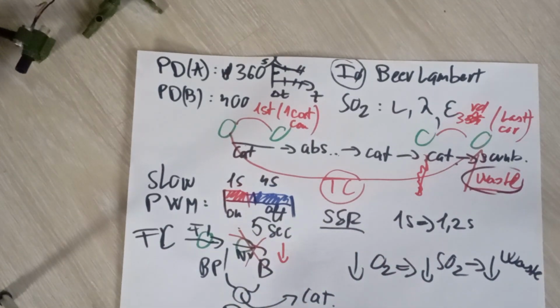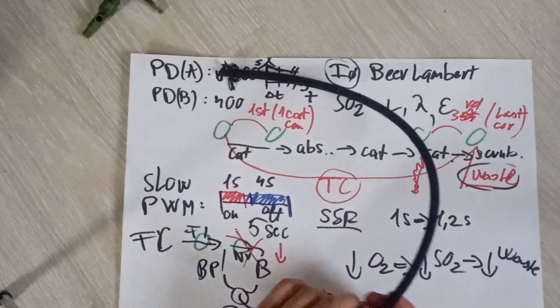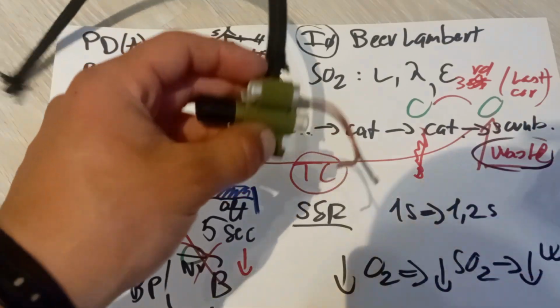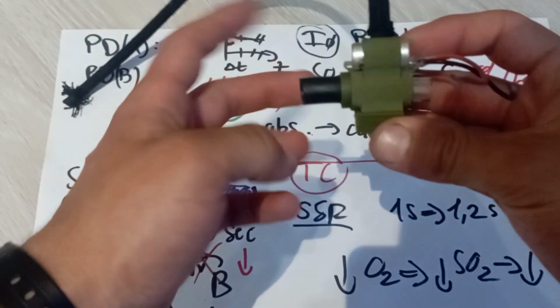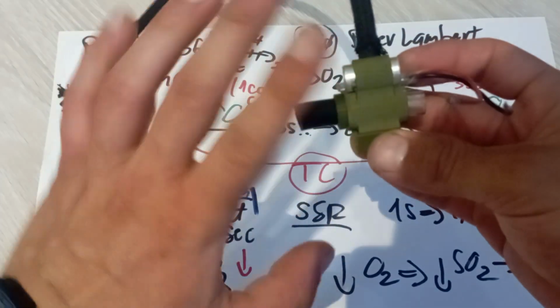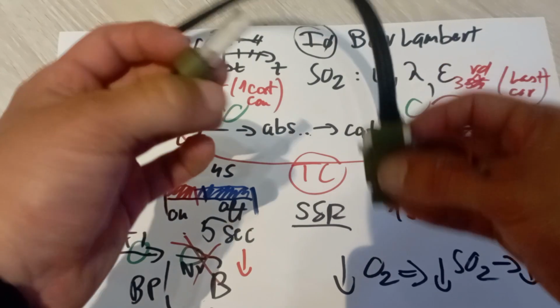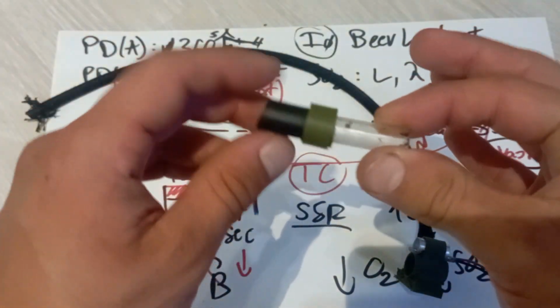And how we do this, if you are just curious, in real life, is more of a tactical thing, but I have the little photo system in my hands. This is basically the system. If we take this, this is the most complex part of the whole system. I'm just going to unplug this. This is a basic component. This is the quartz tubing. This is necessary for it.